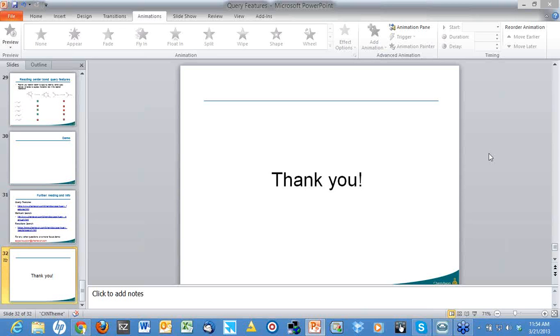Oracle, MySQL, Groovy, these are all supported. And of course, you need the cartridge. You can use our cartridge, JChem cartridge, to basically have all these features available and queryable for you. I hope that answered the question.